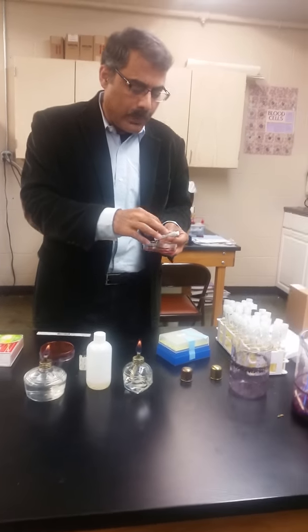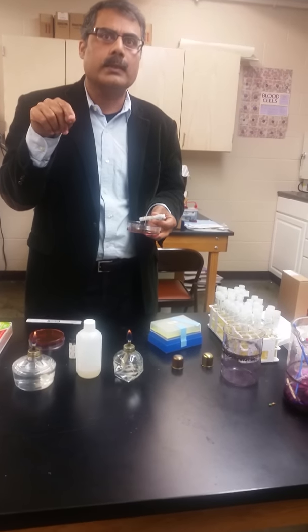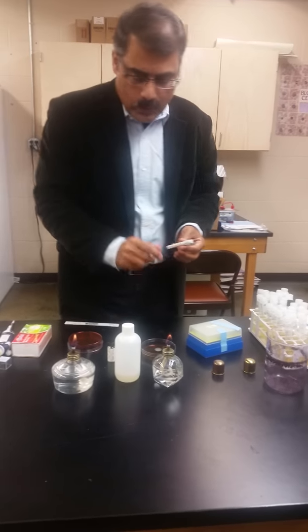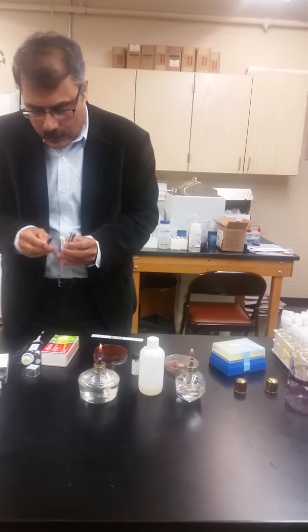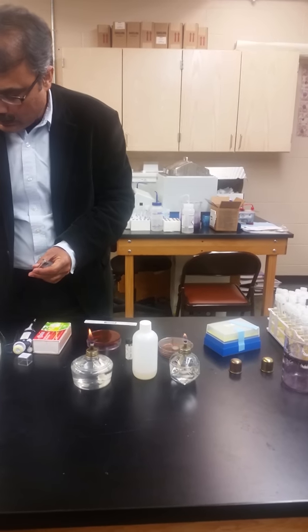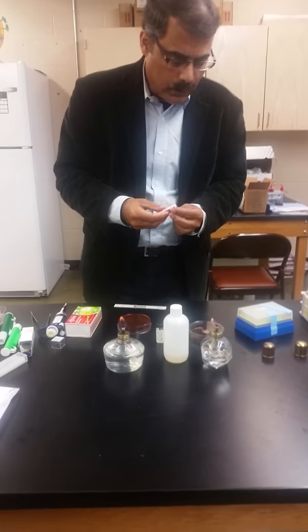So you don't have to remember which antibiotic you put. Actually, it says a symbol on it, and also a number which will tell you the concentration. So this is one. You will take this out, basically from here, and put the other one in a similar fashion, okay.